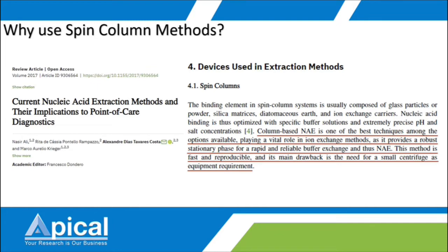For DNA barcoding application, in order to perform a sensitive, specific, and reliable PCR-based assay, the availability of pure DNA as well as easily performed DNA extraction is very essential. So today we are going to talk in detail on the spin column method.